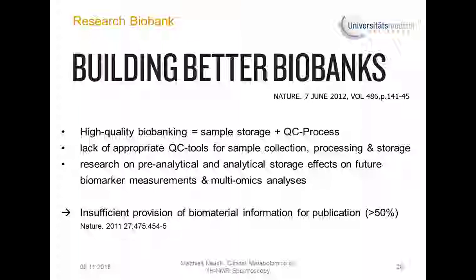And when we look at the literature, we know that in many aspects the biobanking procedures are not as good as they should be. We really need a very high quality process of our sample preparation, the collection of the samples and the storage of our samples.